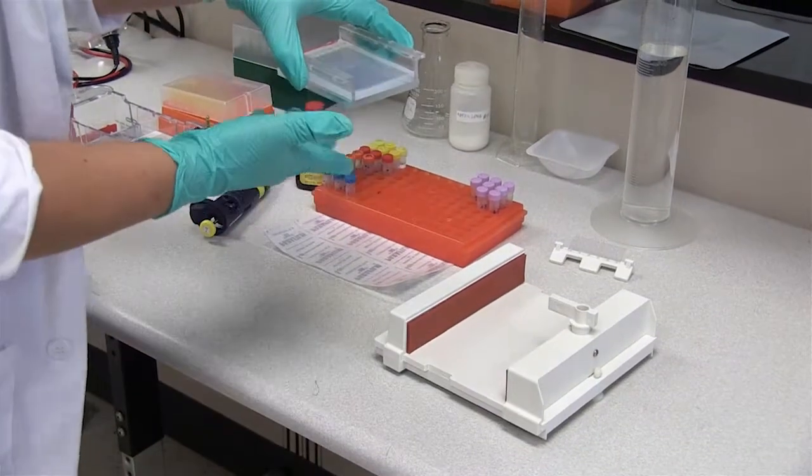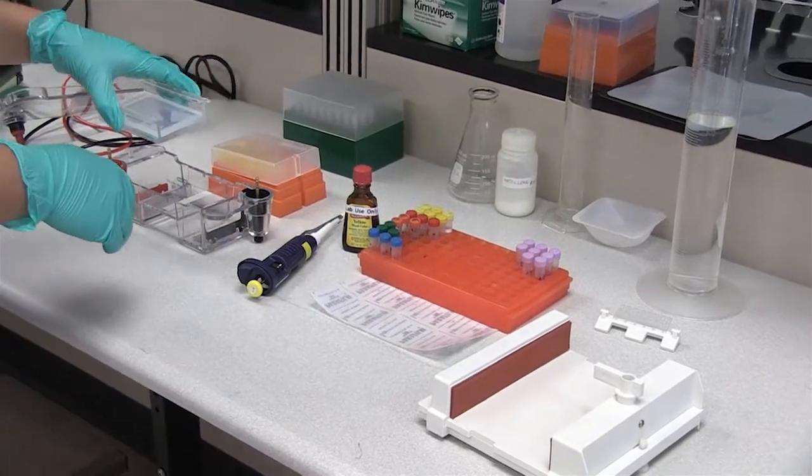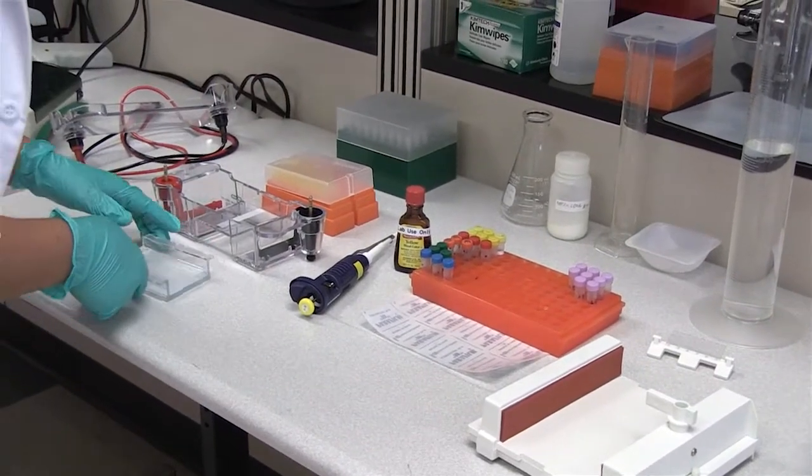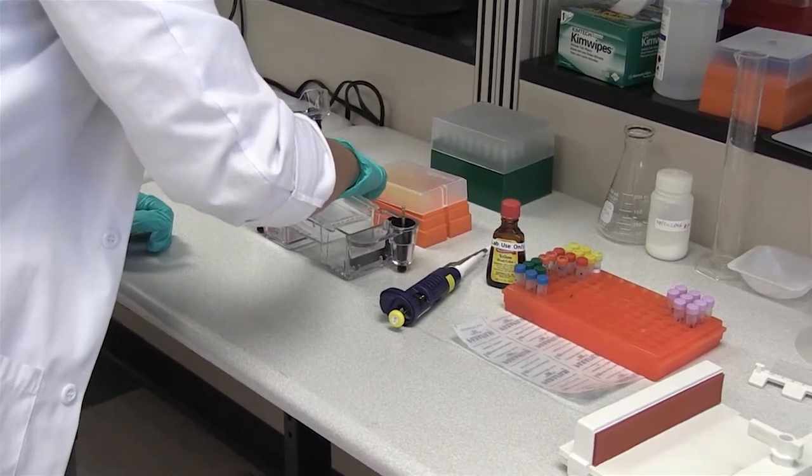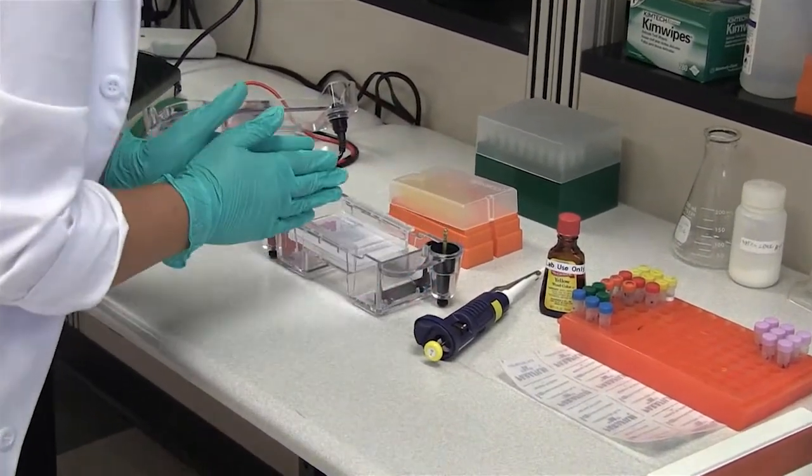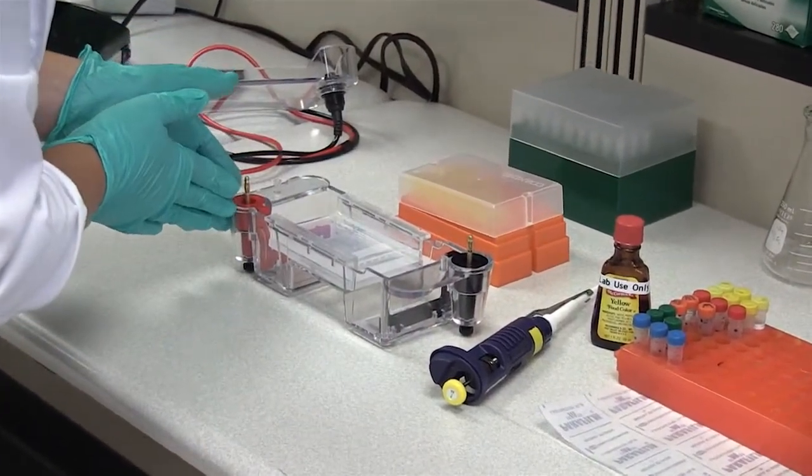So the ends are going to be exposed. It's going to allow you to take that charge. Next thing we need to do is put our tray in our box. And what you're going to do is put the sample side toward the black electrode and leave the open end toward the red electrode.